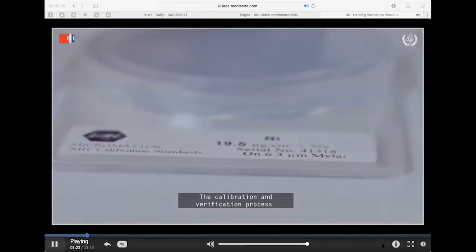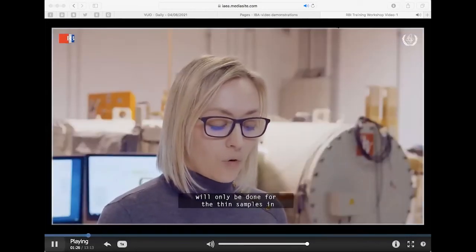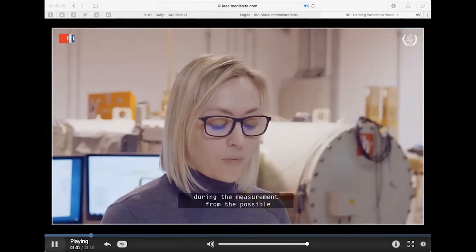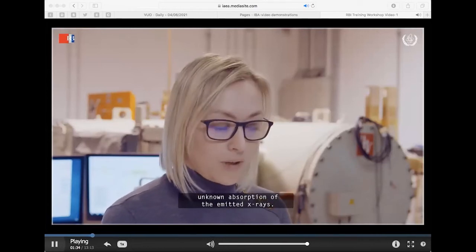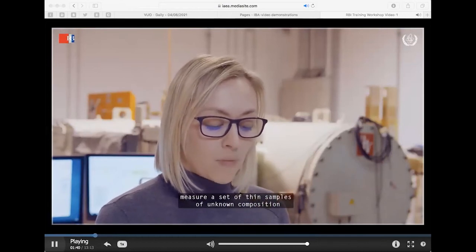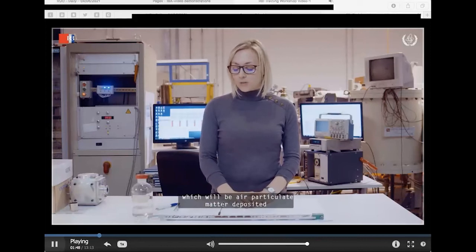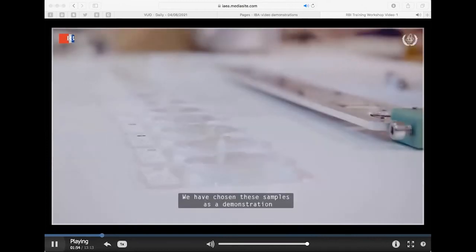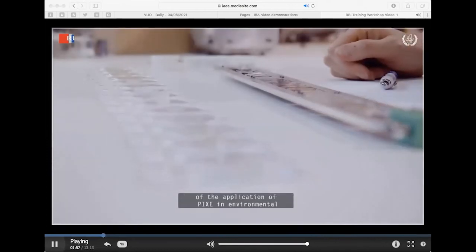The calibration and verification process will only be done for the thin samples in order to avoid any problems that may arise during the measurement from the possible unknown absorption of the emitted X-rays. After this process has been completed, we will measure a set of thin samples of unknown composition, which will also be air particulate matter deposited on a stable solid backing, again a filter. We have chosen these samples as a demonstration of the application of PIXE in environmental monitoring programs or environmental studies.